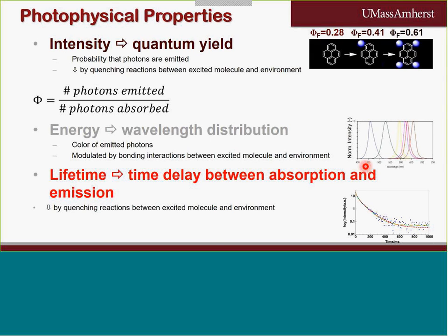The lifetime, which is the time delay between absorption and emission, is one of the most important characteristics that we're going to discuss in this presentation, and it can be affected by quenching reactions between the excited molecules and the environment. So basically we know that the particular optical properties, intensity, energy, and lifetime, are affected by the environment per se. That makes these probes sensitive to what happens around them.